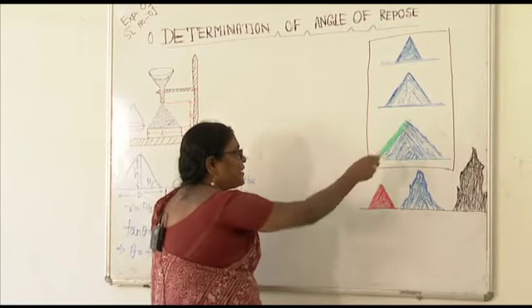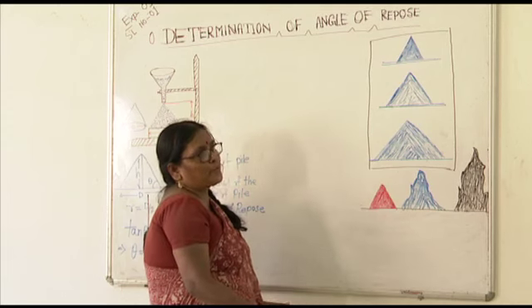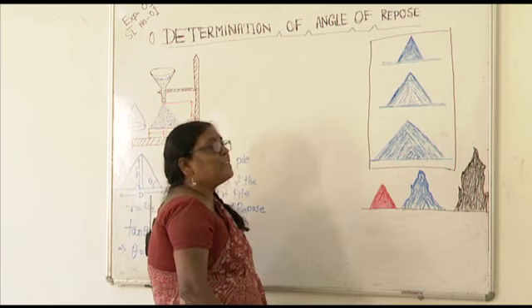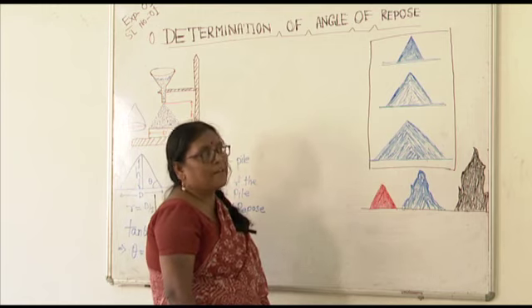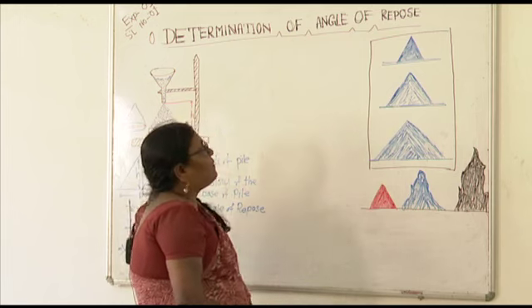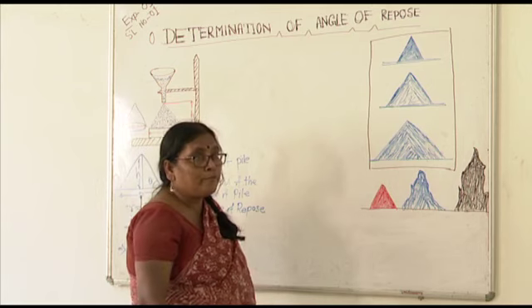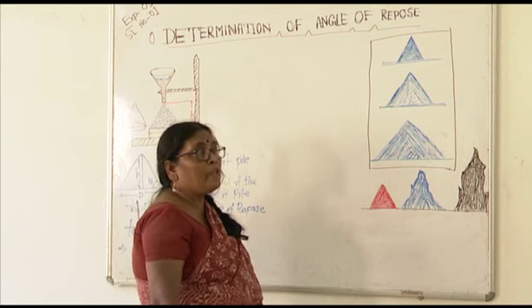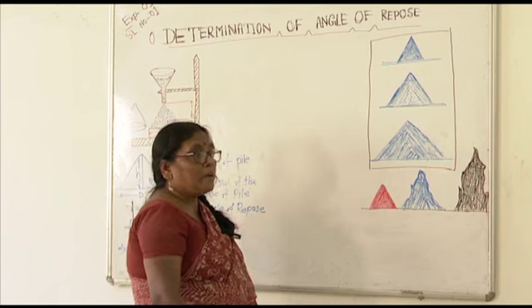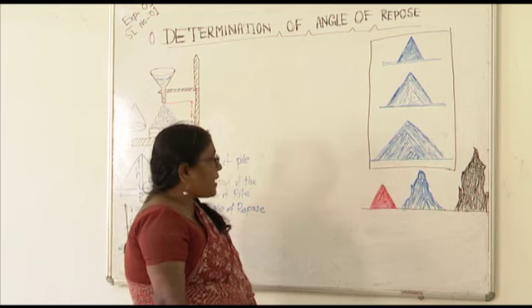They give slants. They make angles. They look like cones. They are tiny hills. And this is the characteristic of the particles. From these characteristics, we can find a number of things, like how they are going to flow when you are performing your real work in the laboratory, or when you are manufacturing your medications in your factory.